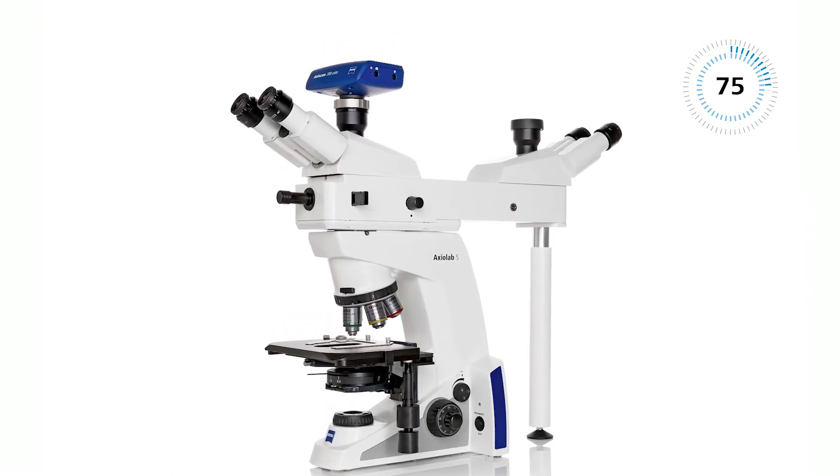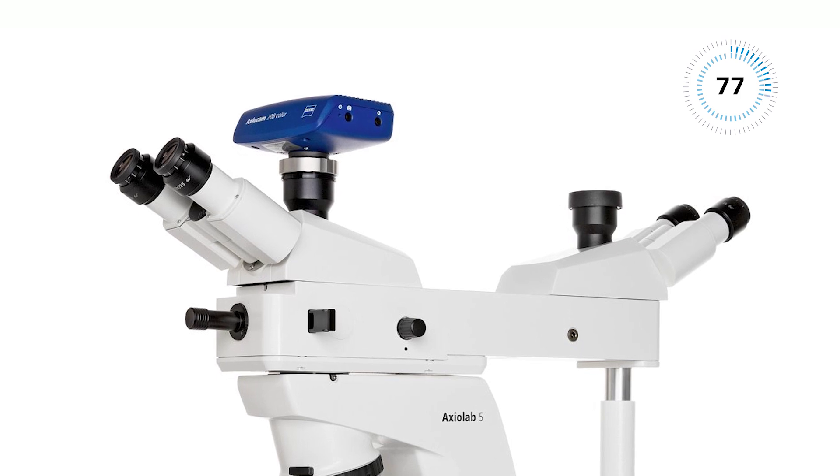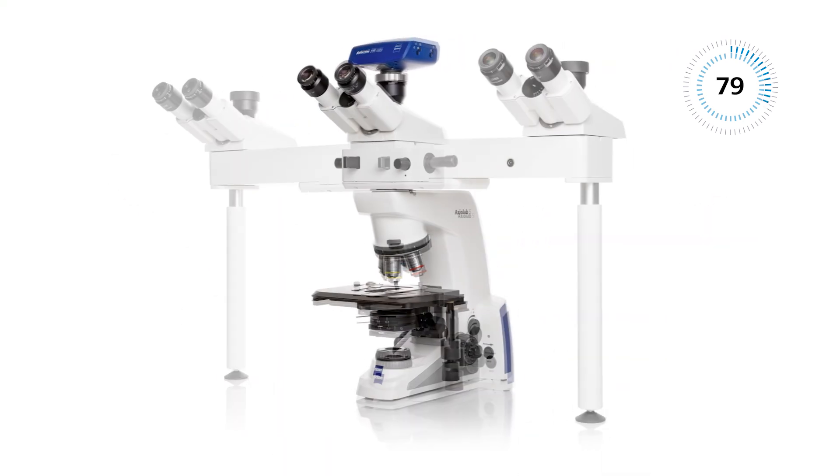Use your microscope for consulting and education. Opt for a dual observer setup that can be extended to up to 21 observers.